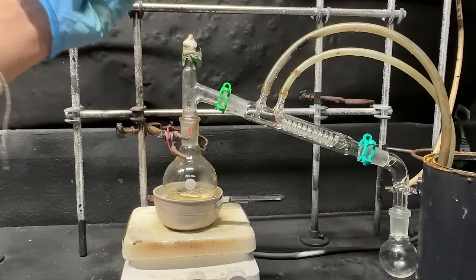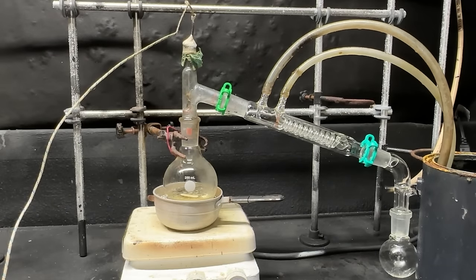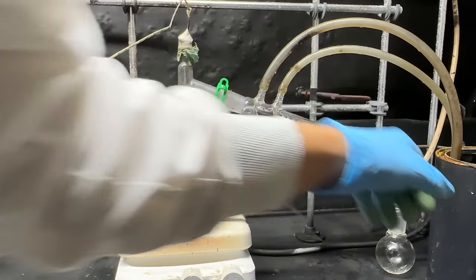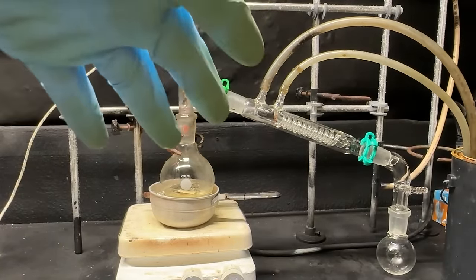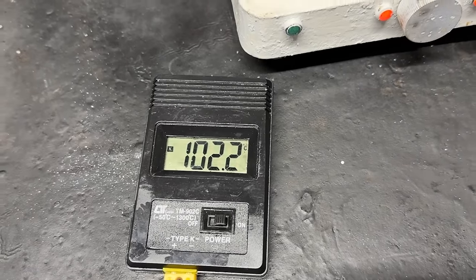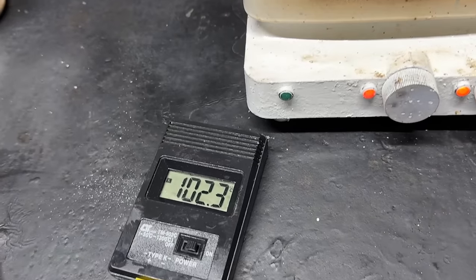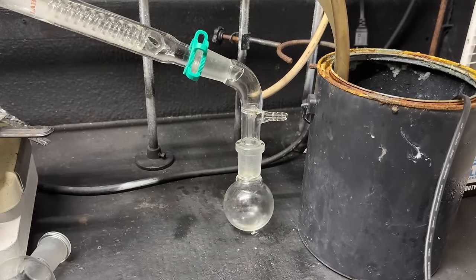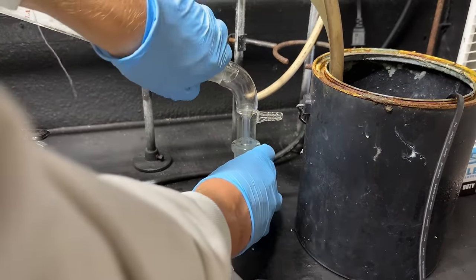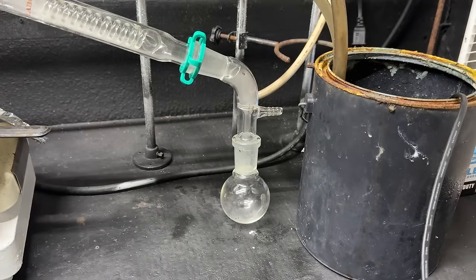We've got one more thing to add: our thermocouple. Now we're going to let this distill. We'll collect and discard the first fraction, and then the fraction we're going to keep will be from 135°C to about 142°C. We're getting consistent drops — probably water at first. My thermometer is tweaking a bit but we're getting right into the range of banana oil, so I'm going to flip out the flasks and let that distill over.